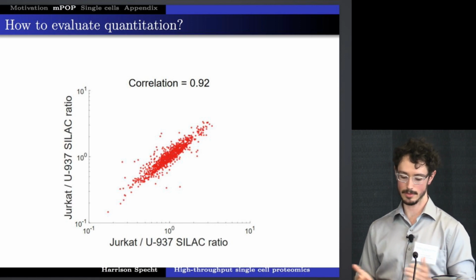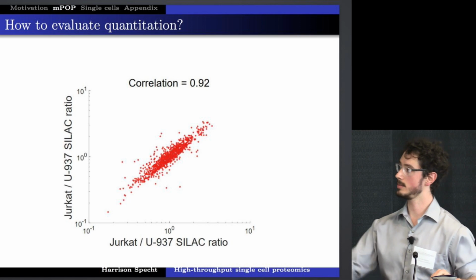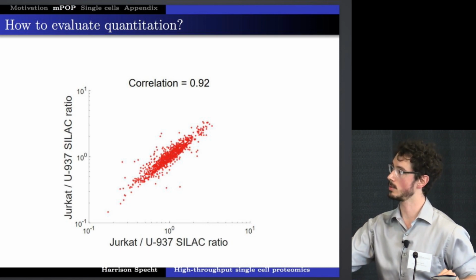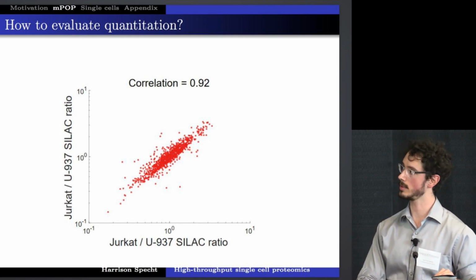And we say, all right, what's good quantitation look like? We take this to be relatively good quantitation and reproducibility of quantitation from the urea sample. So this is one value. We calculate the Pearson correlation for it. So this is sort of zooming in on one sample, or sorry, two samples, and what that would look like.